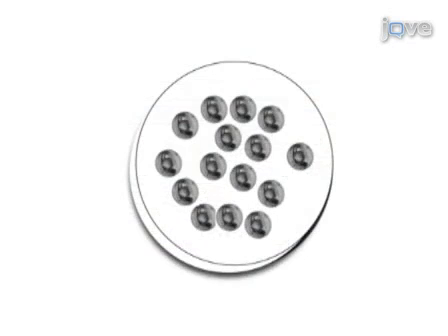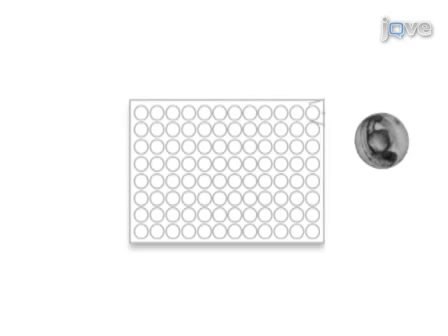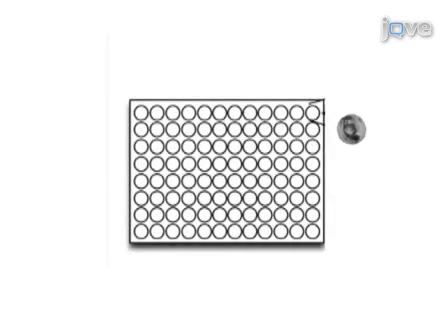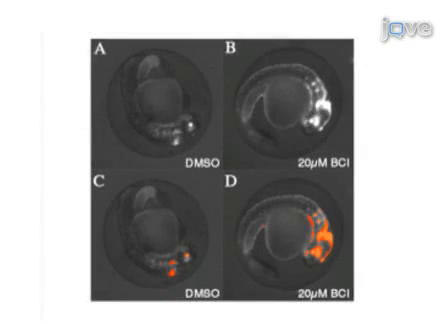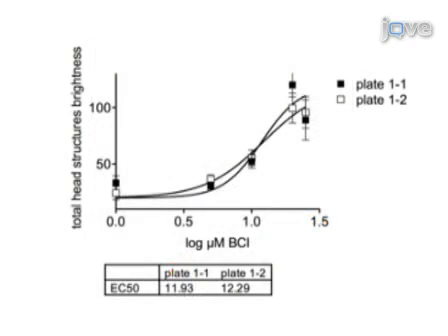The embryos are incubated overnight, then placed into individual wells of a 96-well round-bottom plate. The small molecule BCI is added to hyperactivate FGF signaling, and the plate is incubated for 6 hours. Images from each well are captured with a confocal plate reader and analyzed using a self-designed algorithm which reports fluorescence intensities in specific embryonic structures.